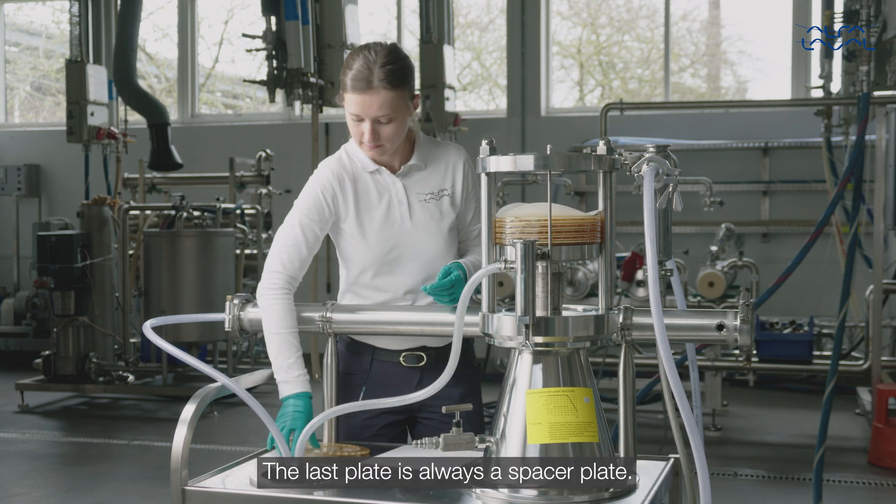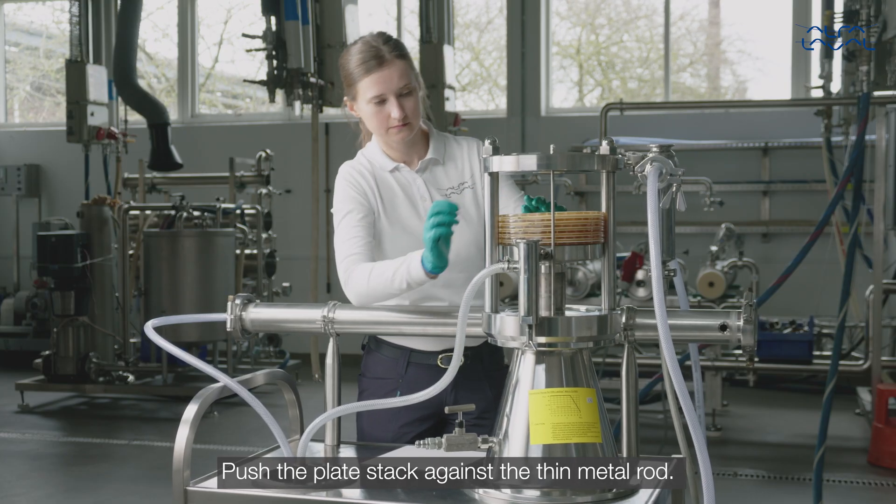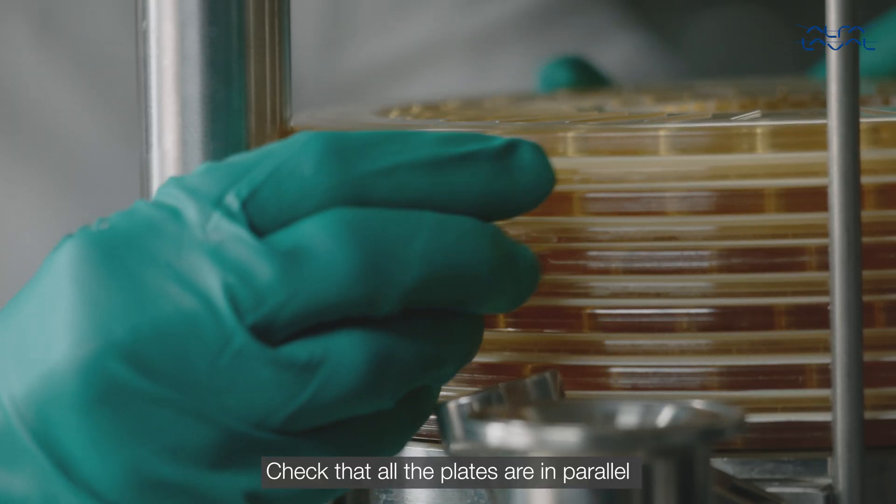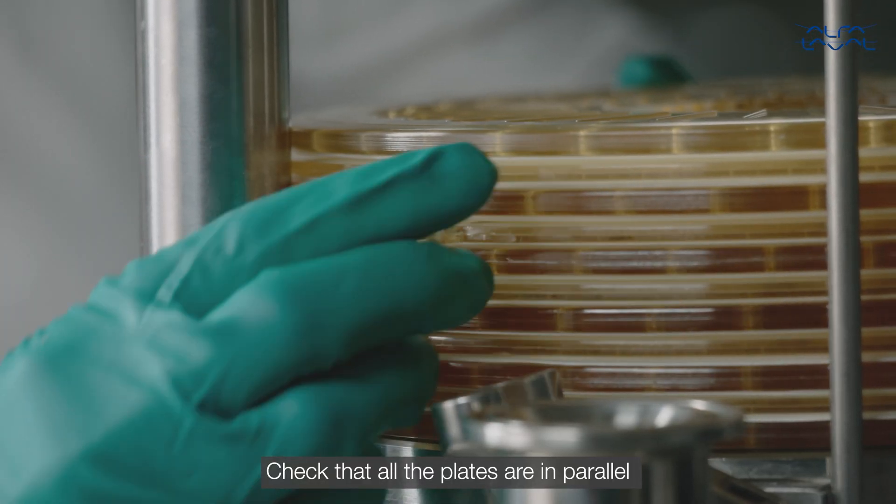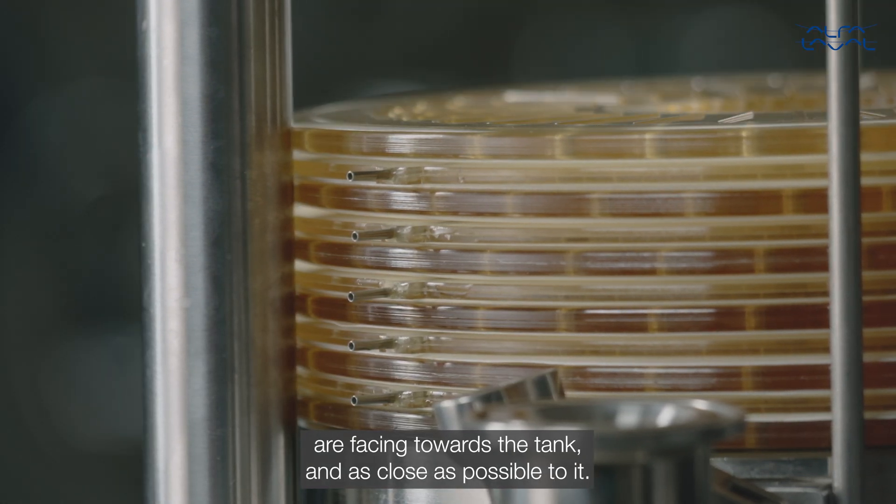The last plate is always a spacer plate. Push the plate stack against the thin metal rod. Check that all the plates are in parallel and arrange them so that the permeate hose connections are facing towards the tank and as close as possible to it.